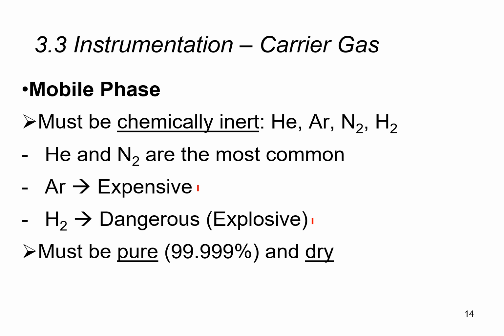These two gases can also be purchased quite readily in a very pure form, 99.999%, and can also be purchased in a very dry form. So these are not issues at all.